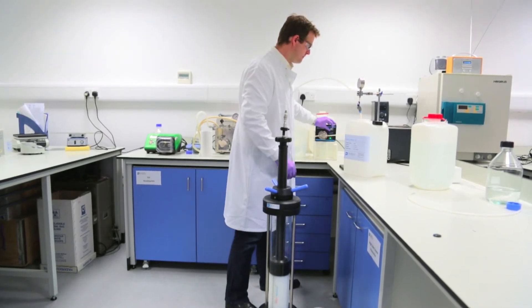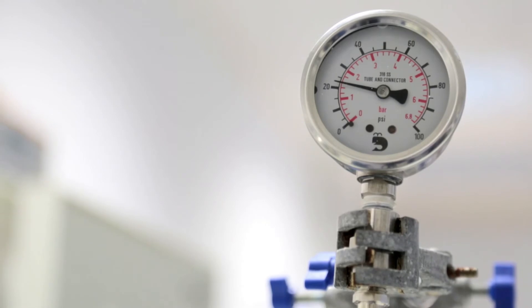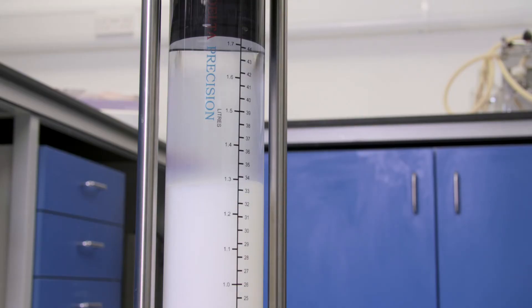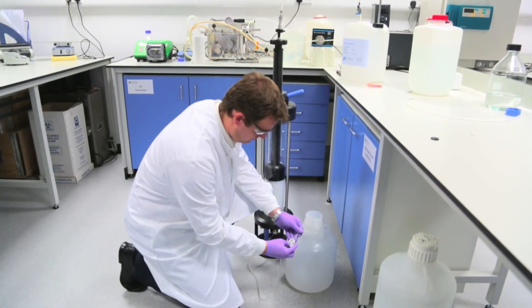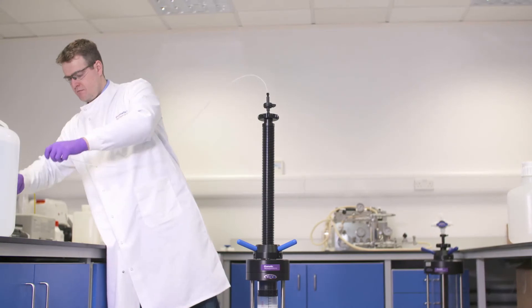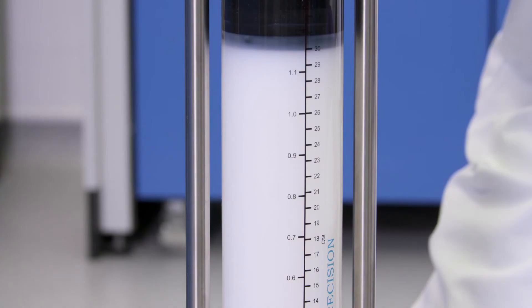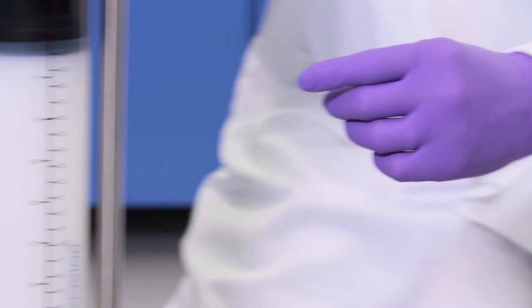Allowing excess storage solution to exit the top of the column, attach the tubing to your pump or system. Remove the bottom seal and commence the flow rate to obtain a column pressure of 1.5 bar. Continue the flow for two column volumes, then note the height of the packed bed. Stop the flow and close the bottom of the column, open the top of the column and lower the adapter until the seal is approximately 1 cm below the height of the packed bed.